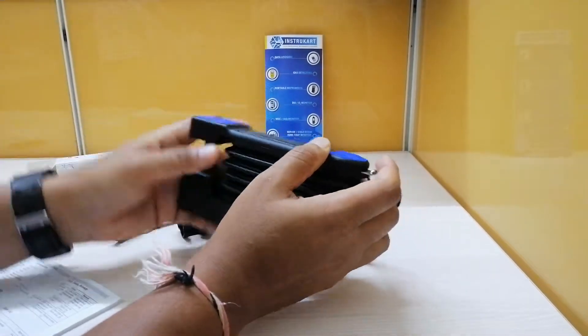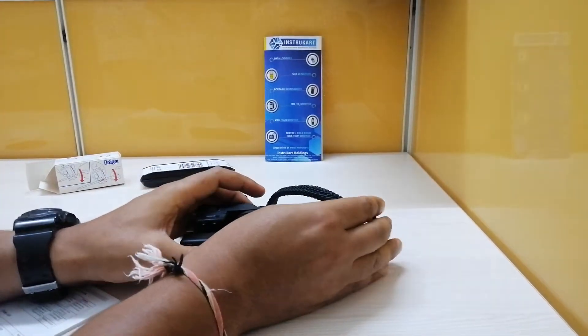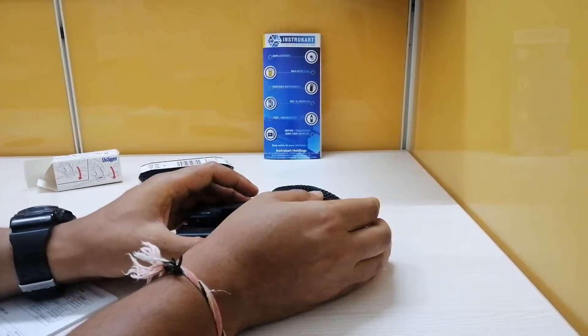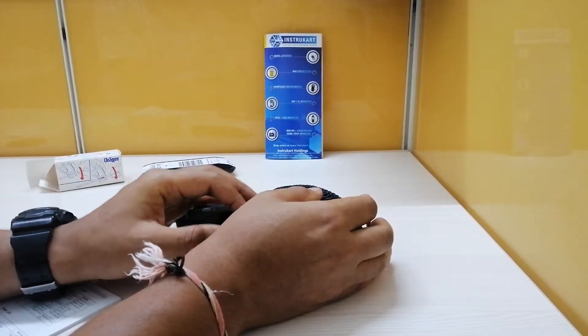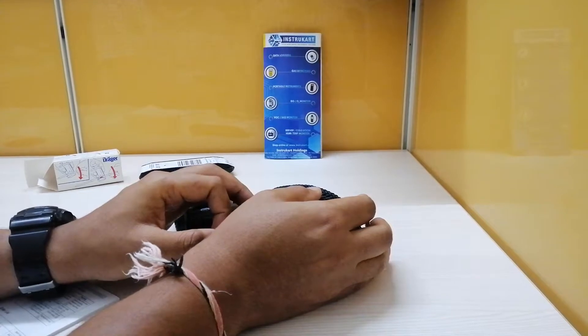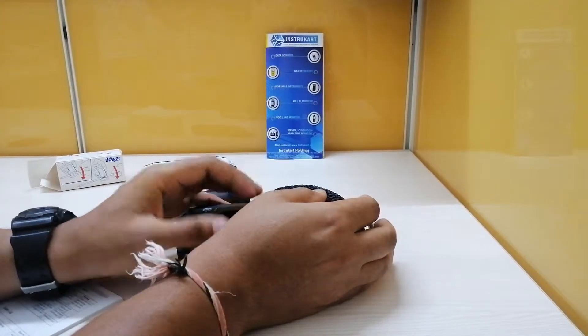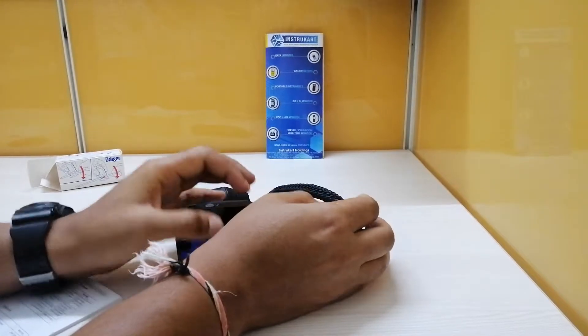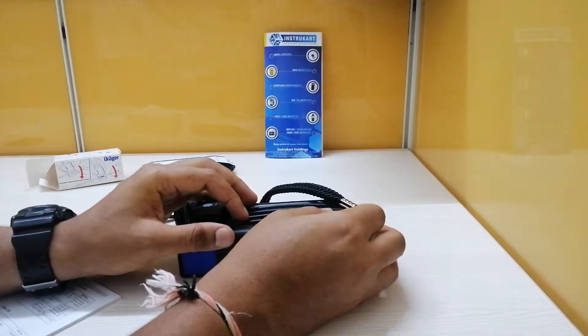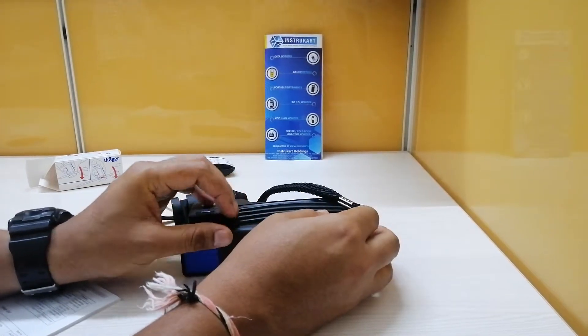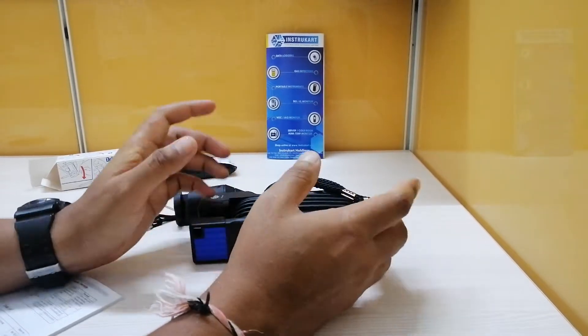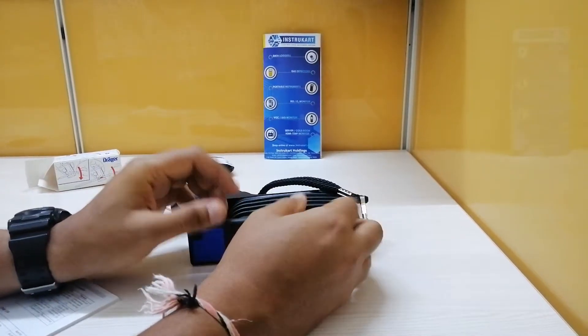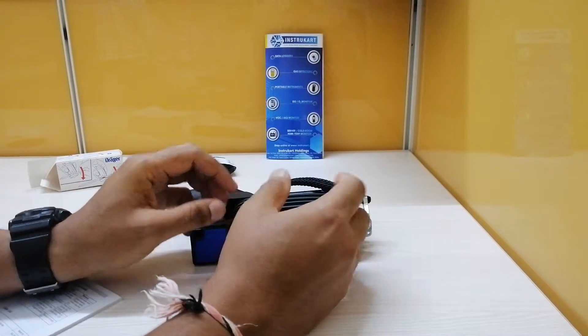This pump consists of these parts, and for the glass tube, this is the glass vial filled with a chemical reagent that reacts to a specific chemical or a family of chemicals. The applications where we use this are ambient air for health and safety levels, stack gases, motor vehicles, pressurized gas line samples, and any other technical gases or analysis of samples in laboratories.